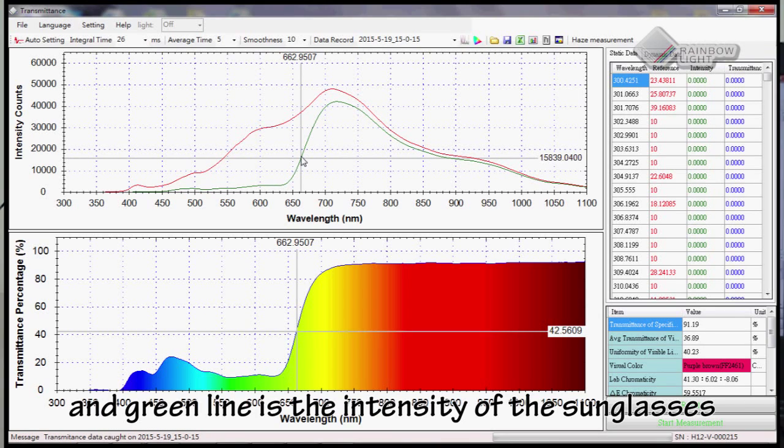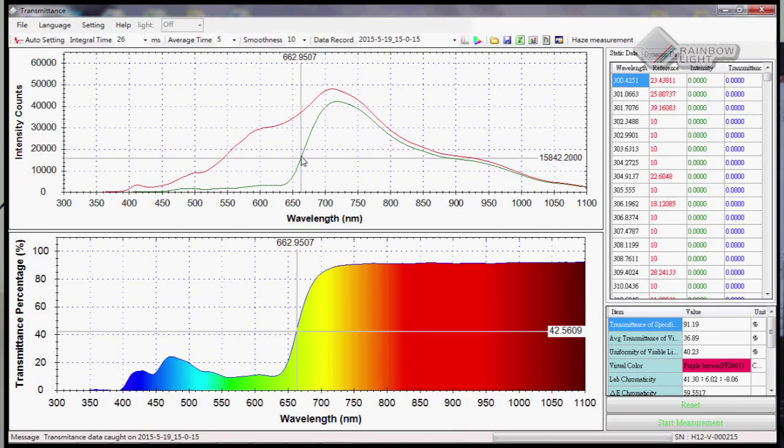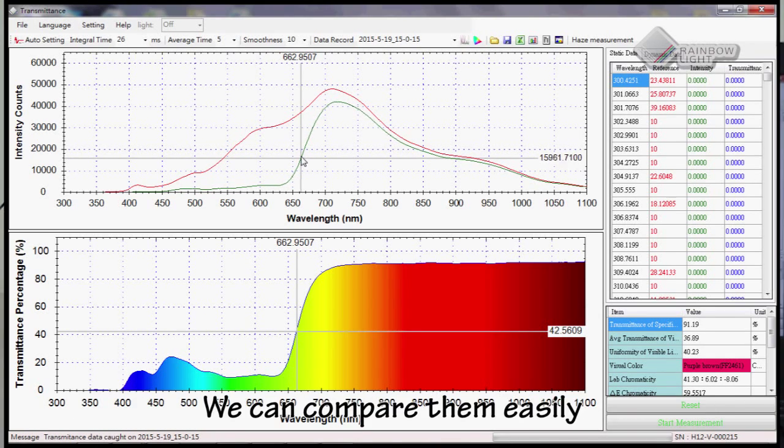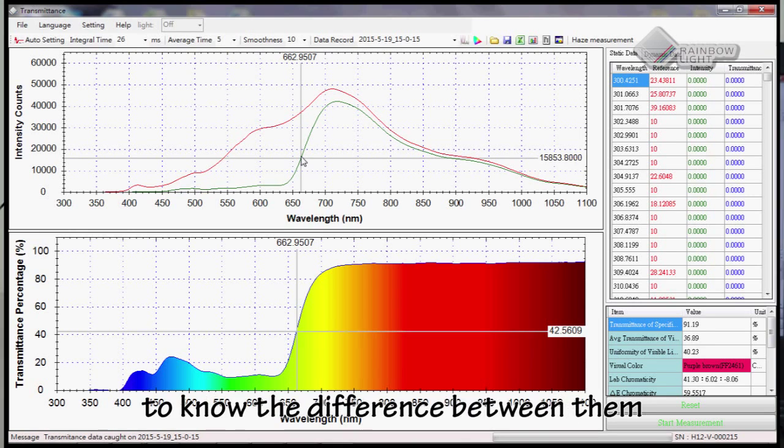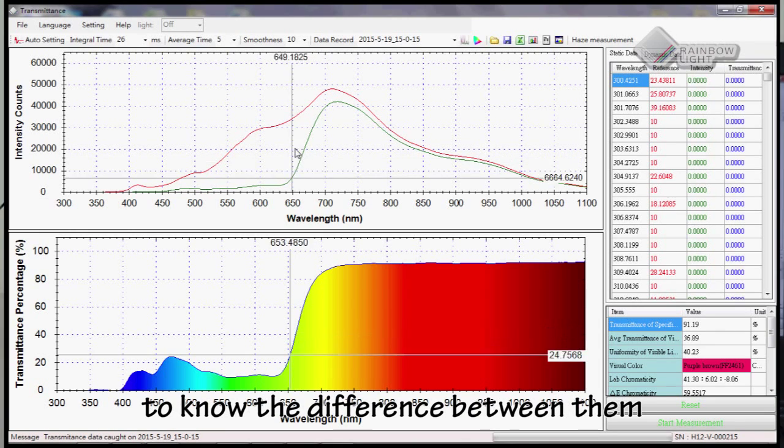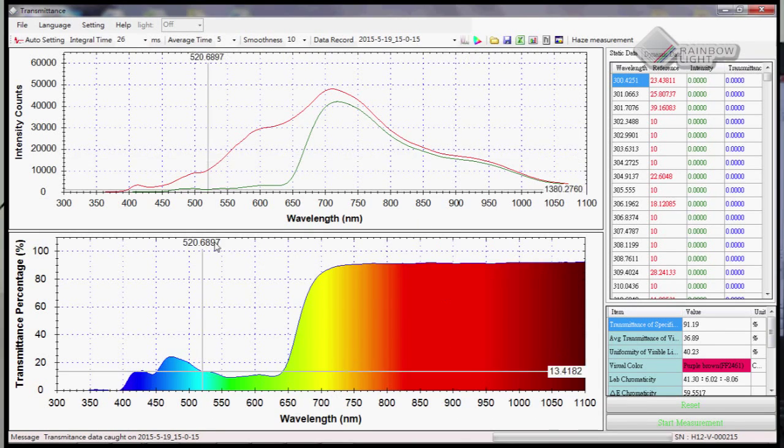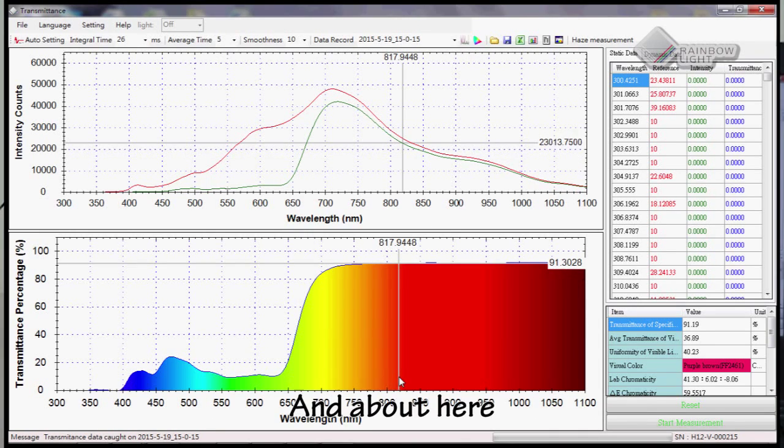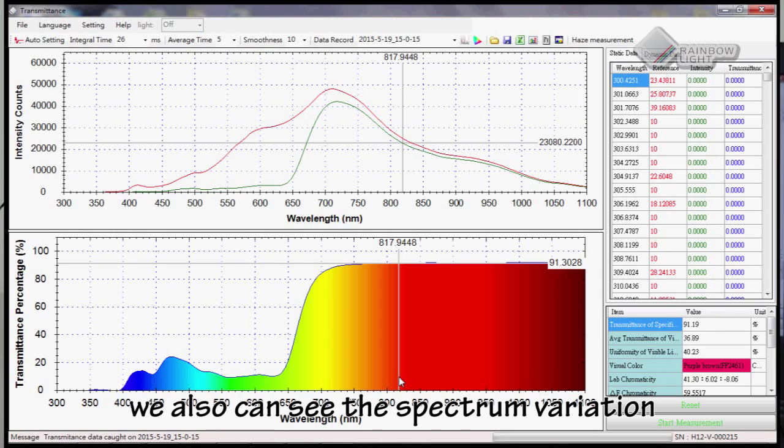The green line is the intensity of the sunglasses. We can compare them easily to know the difference. Above here, we can also see the spectrum variation.